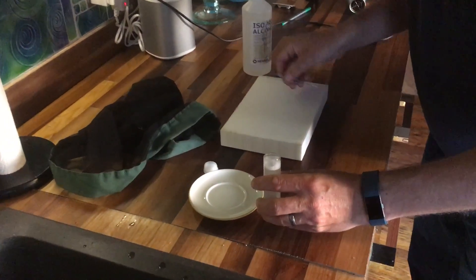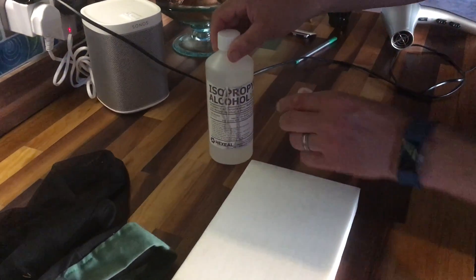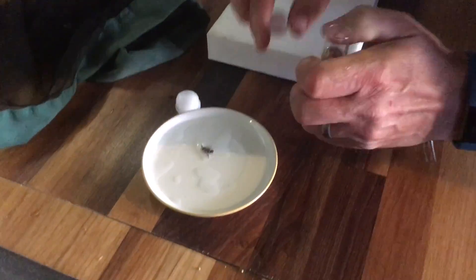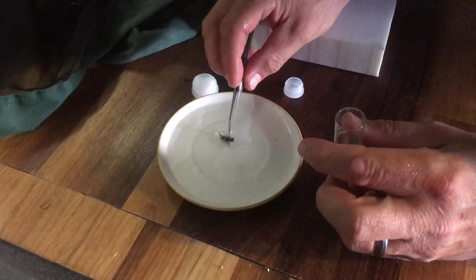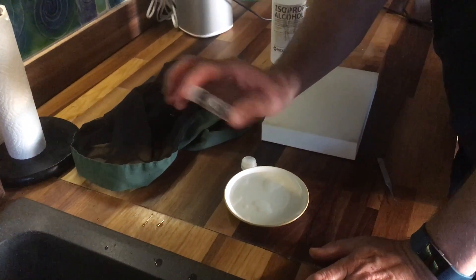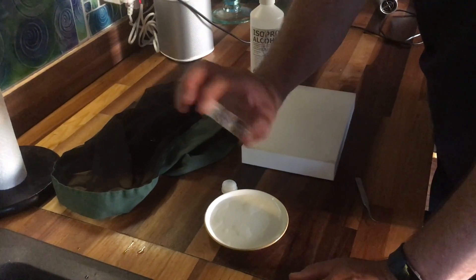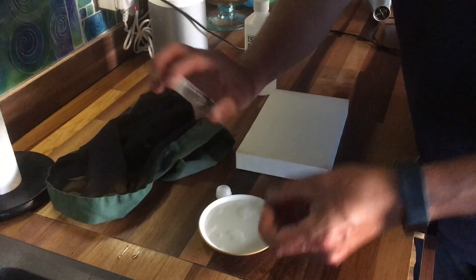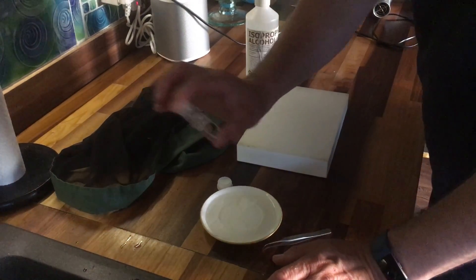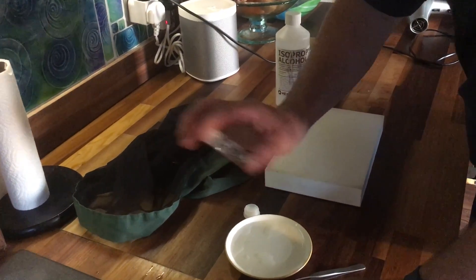Pop it open. Get a small dish ready and some forceps. There's our bee. Now we do some of this alcohol, rubbing alcohol, a little vial of that. Pop the lid off. Get the bee out. Drop it into the alcohol - it sinks right down to the bottom. And again, give it a good shake for about 30 seconds. This is how it gets all the detergent off. That's looking pretty good.